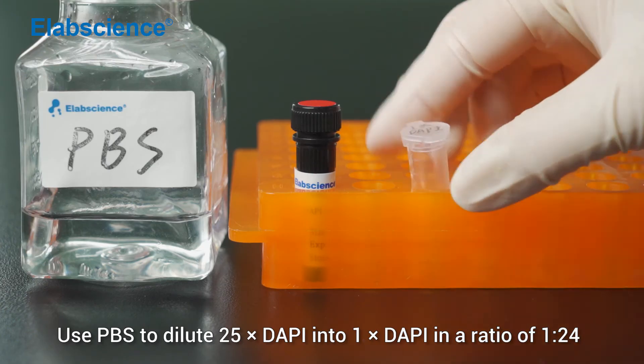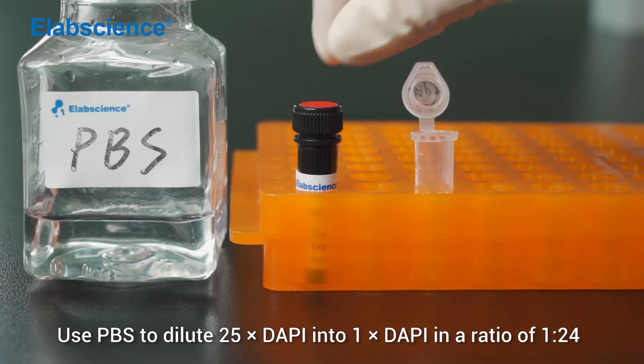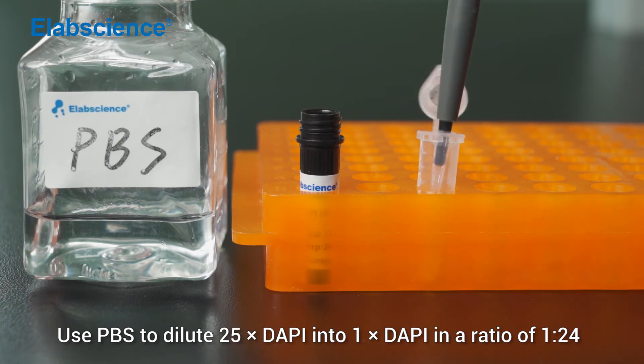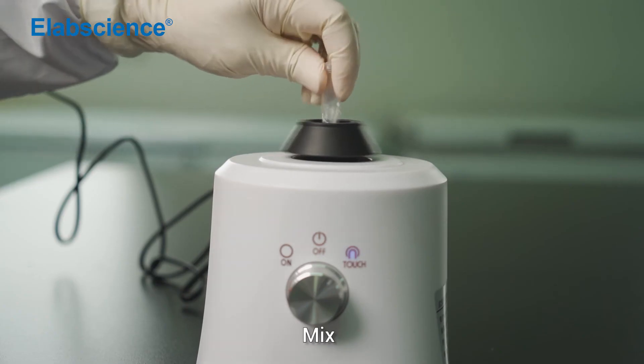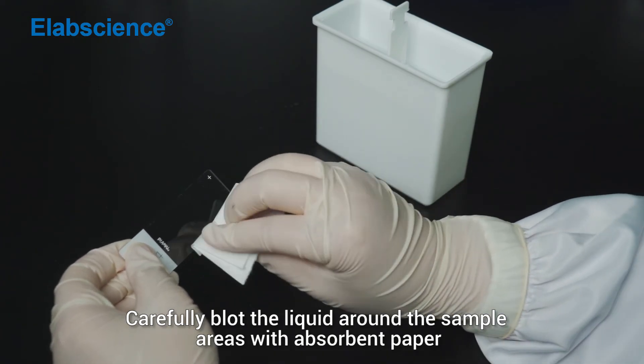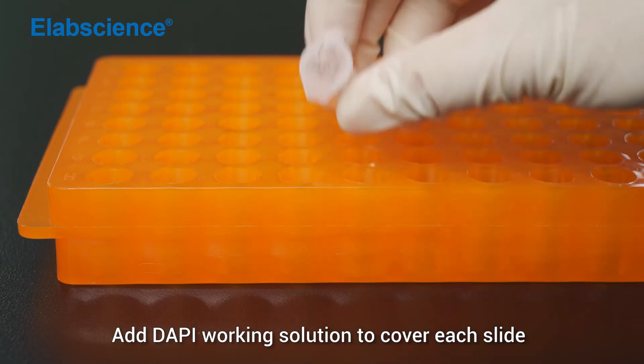Use PBS to dilute 25x DAPI into 1x DAPI in a ratio of 1 to 24. Mix. Carefully blot the liquid around the sample areas with absorbent paper. Add DAPI working solution to cover each slide.